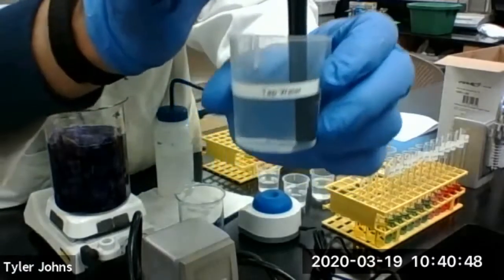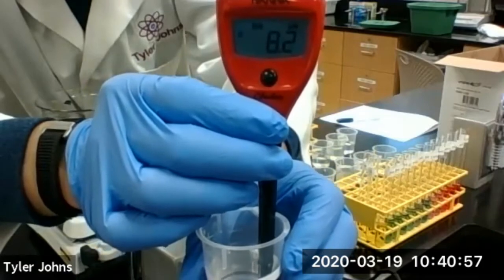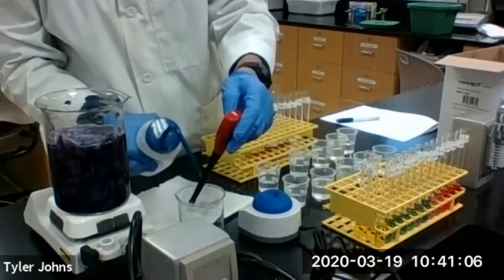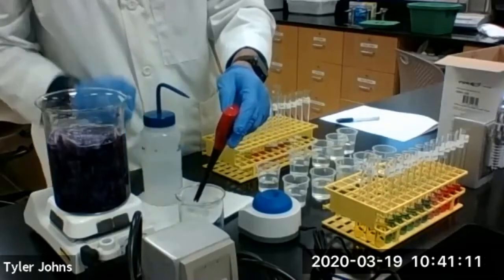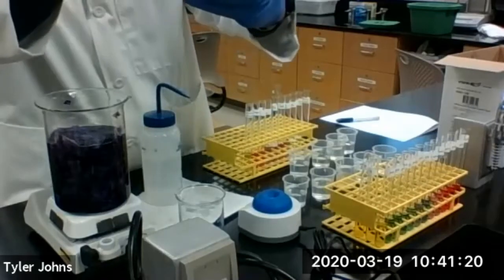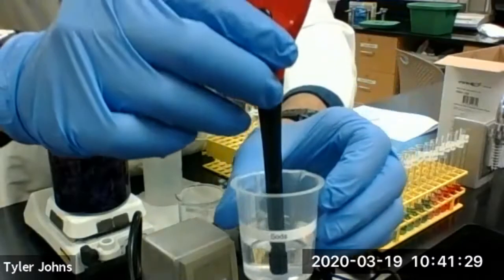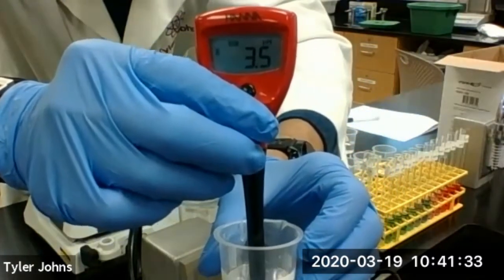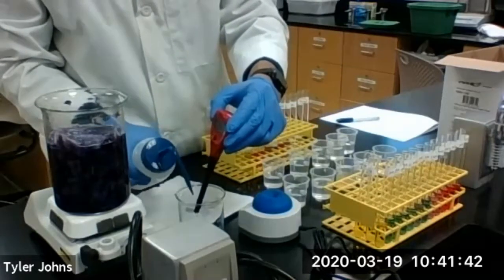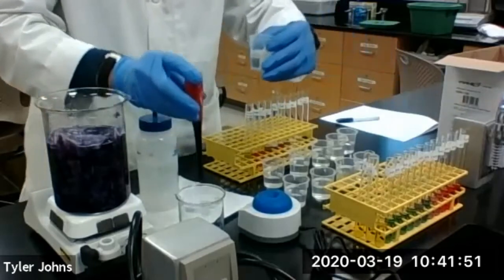Okay, so we have our tap water solution. And our pH. Okay, we'll rinse our probe. We'll move on to the soda solution. So here's our soda. And our pH meter reading. Let's rinse. Now we'll do liquid dish soap.